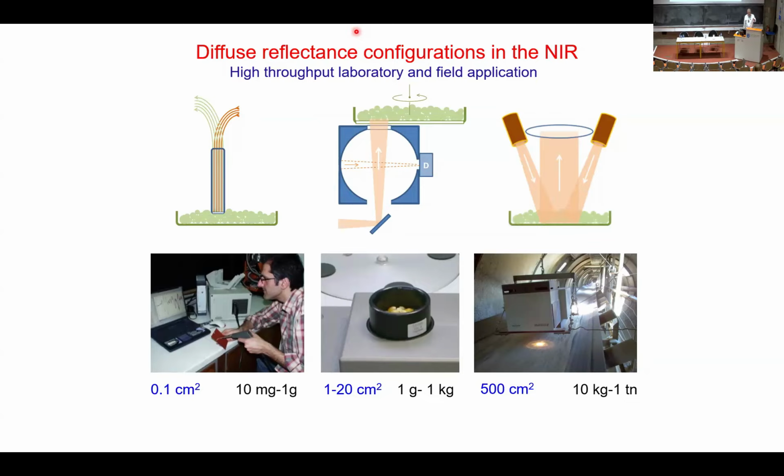And clays can be, at this level of grain, very heterogeneous. So by doing that and playing with the size of this, you can study statistically meaningful information for samples between 1 gram and 1 kilogram, whereas the other is sub-gram. And then you can do it remotely. This is an application from many years ago, 25 years ago. This is an application over a conveyor belt. This is bentonite on this conveyor belt, and it's measuring in real time without touching it. And it's reporting its spectrum, which is correlated with other things. So by that, you can measure from kilos to tons.